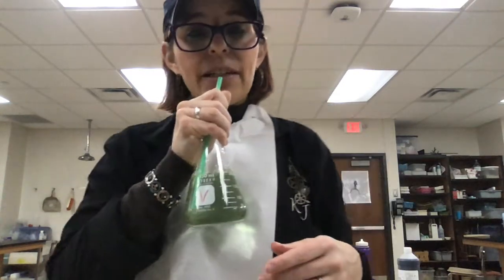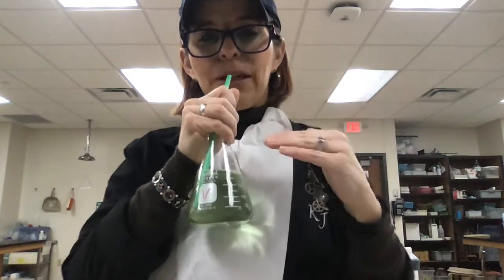We're already seeing it at the neutral color where it's going between blue and yellow, so we get green. I hope you're speeding this up because this will be hilarious fast.